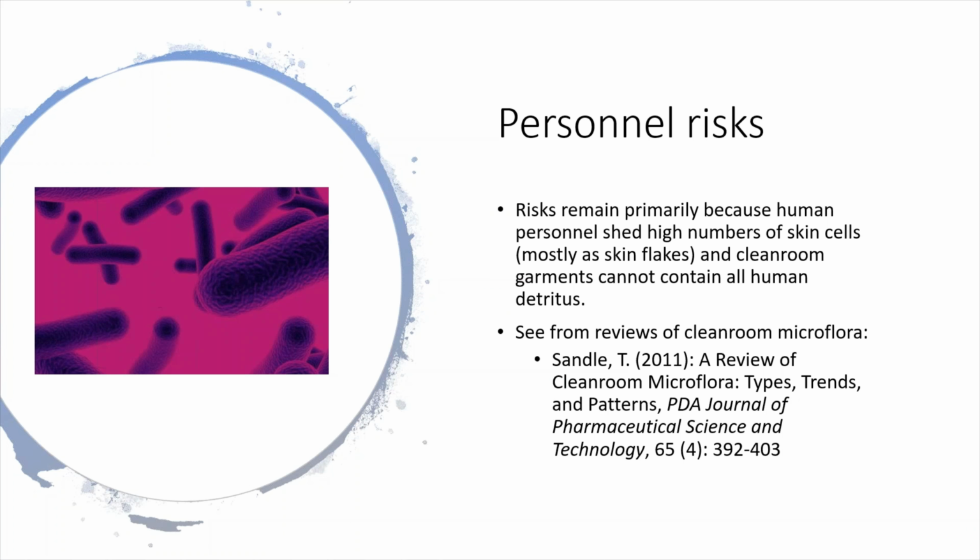You can then start to overlay what you might find in cleanrooms from environmental monitoring with what might have originated from the people, and then link to what might be connected with the human microbiome. And some of this I've gathered from a study that I undertook, which was a 10-year review of cleanroom microorganisms.